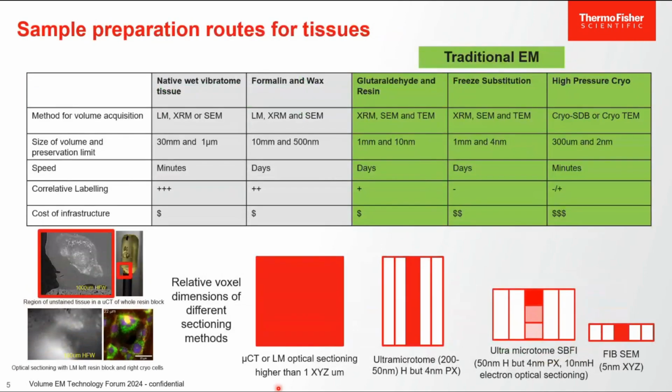So what I'm going to concentrate on really is the stuff in green. And we do accept data from upstream. You can correlate data across. Until recently, as I mentioned, there's things like XRM, for example, which was great for upscale imaging. And you'll see today, obviously, with the work from Sirius, that you can also leverage X-ray with the cryo world as well. So that's really quite exciting.